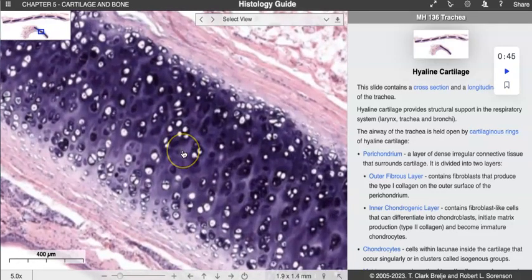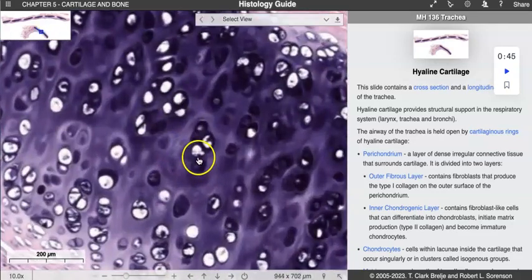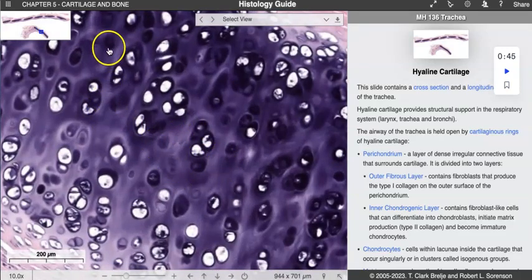So even if we zoomed in a little bit farther here, we can see, again, this nice background of our cartilage matrix, nice and smooth. The open white chamber is going to be the lacunae, and every so often, as the tissue is cut, we can find the actual chondrocytes inside, right? They're living inside of that tissue.